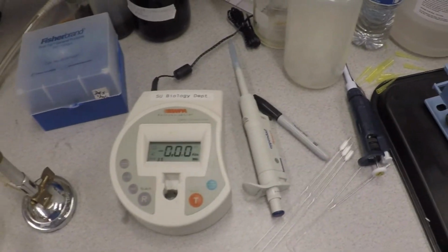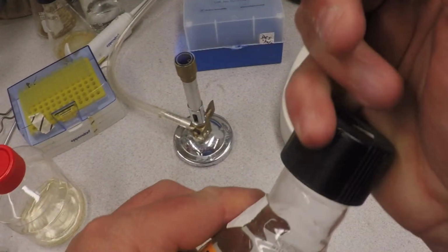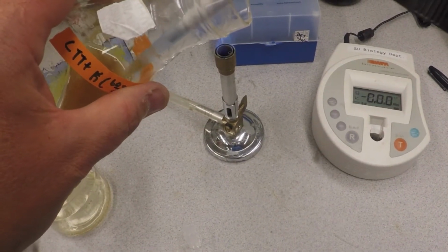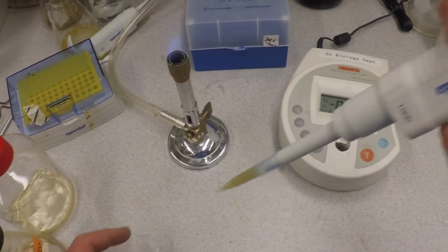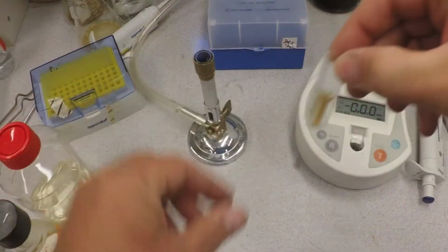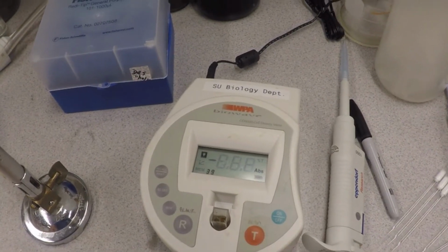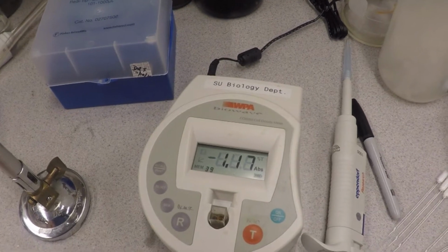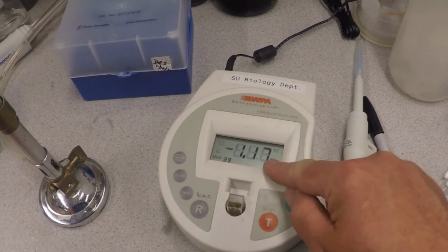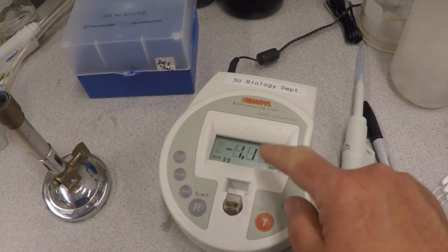Now, you take your sample. New tip, sterile technique. Put it in and hit read. And we get 1.17 in this case, okay? So when we plate these out or we look at our data, we'll see if this number actually correlated. That means to be a little over 1 times 10 to the 9th cells per mil if this is correct.